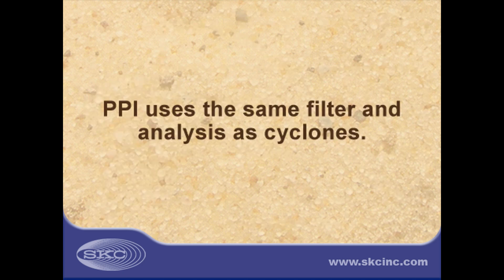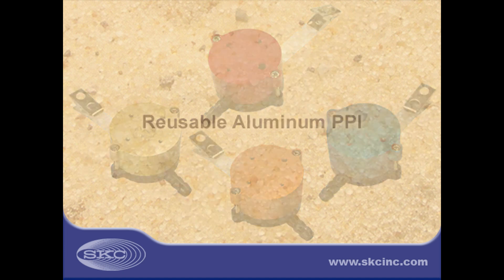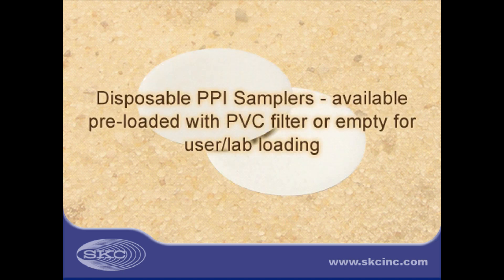The recommended PVC filter and analysis used with PPI is the same as that used with cyclones. SKC originally produced PPI samplers in reusable aluminum; however, users asked SKC to produce PPI samplers in single-use plastic, known as disposable PPI samplers. These samplers eliminate assembly and cleaning. SKC offers its plastic disposable PPI samplers pre-loaded with PVC filter for chemical analysis of silica, and they are also sold empty for filter loading by the user or lab.